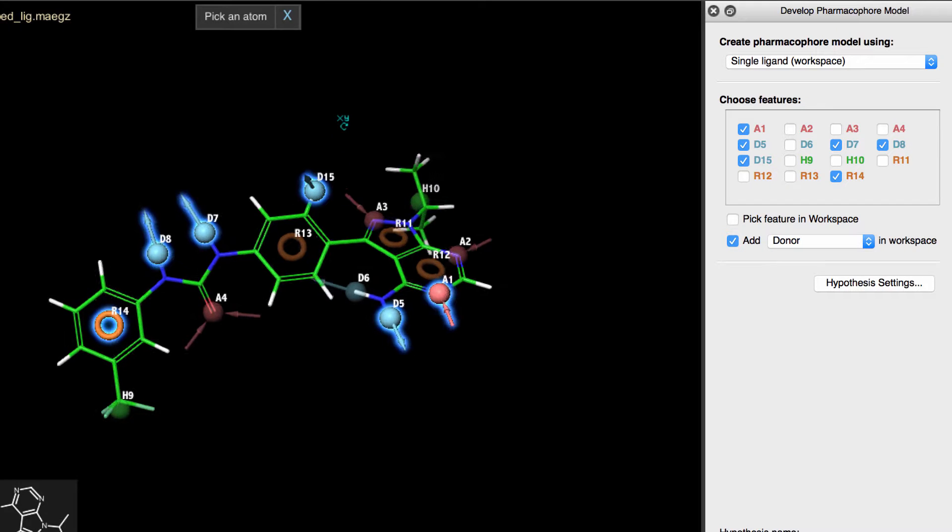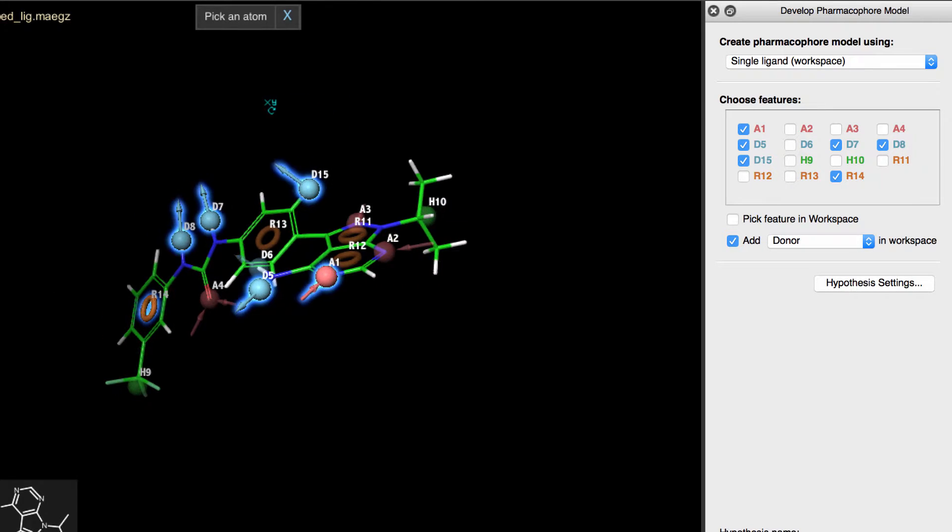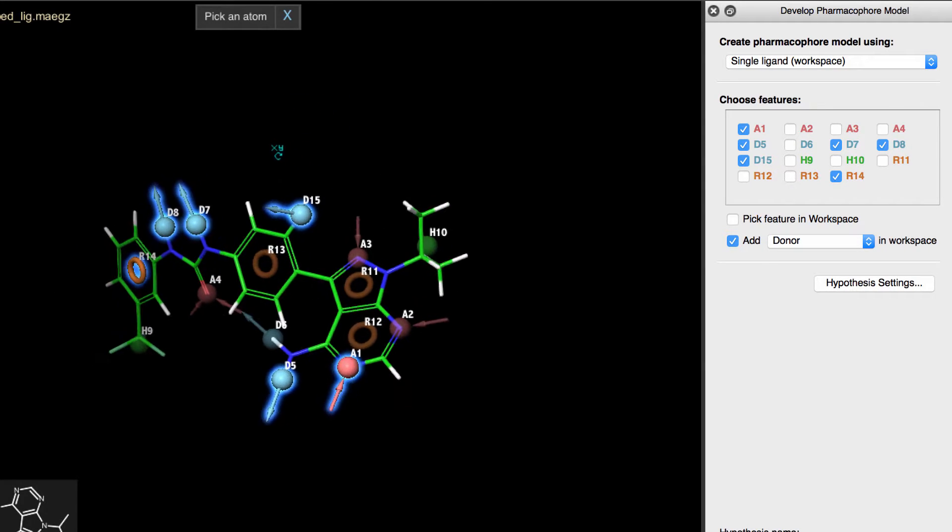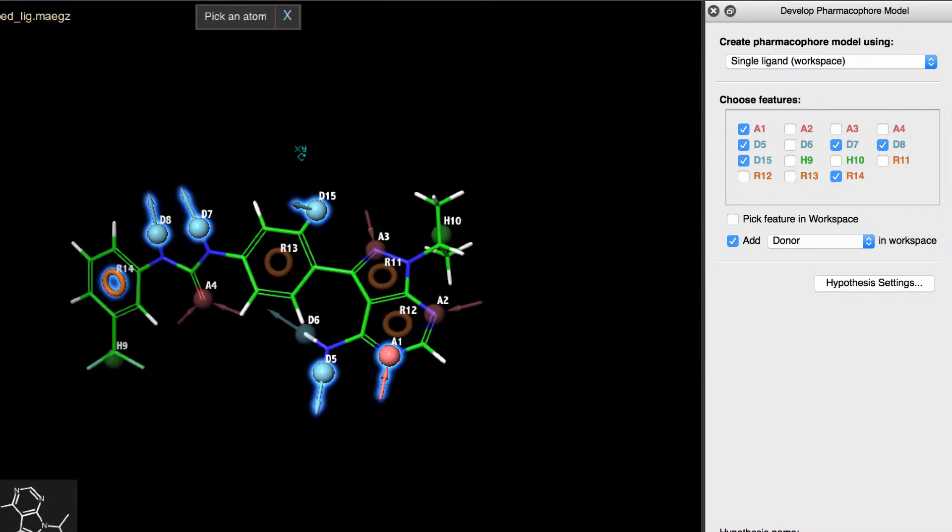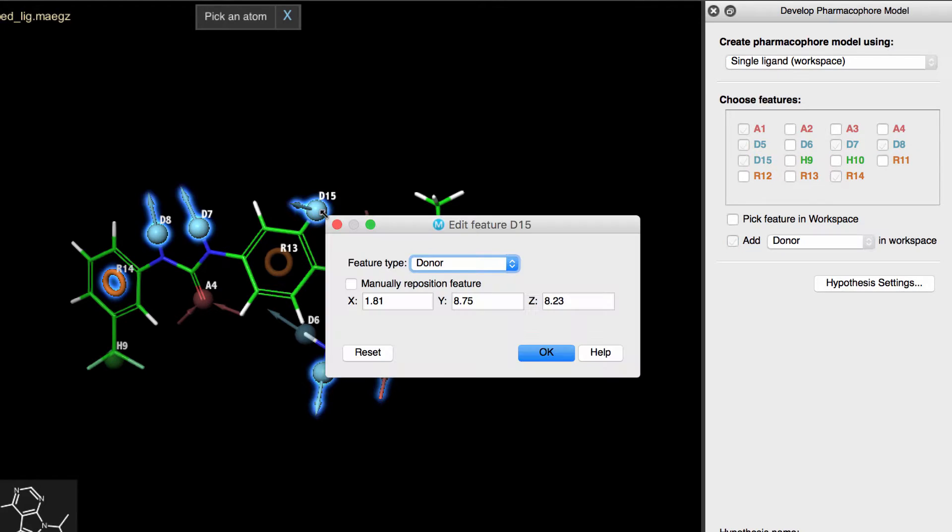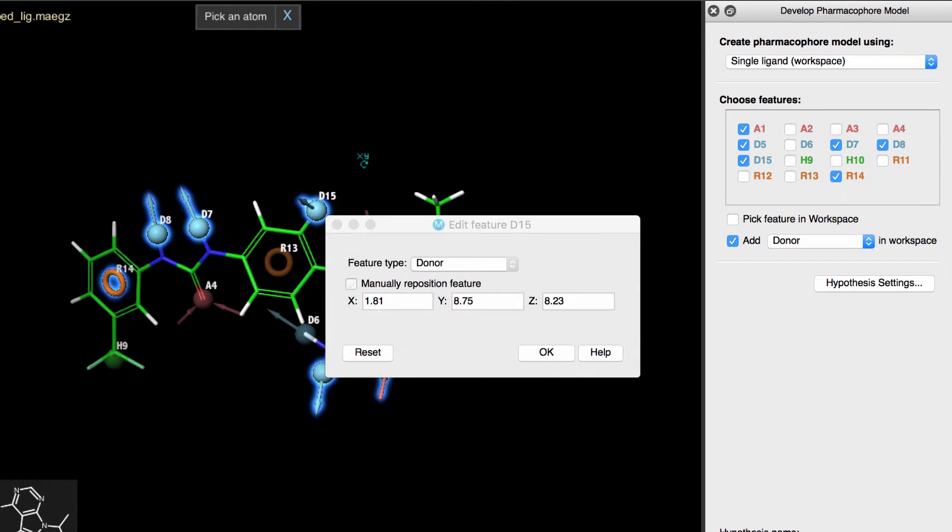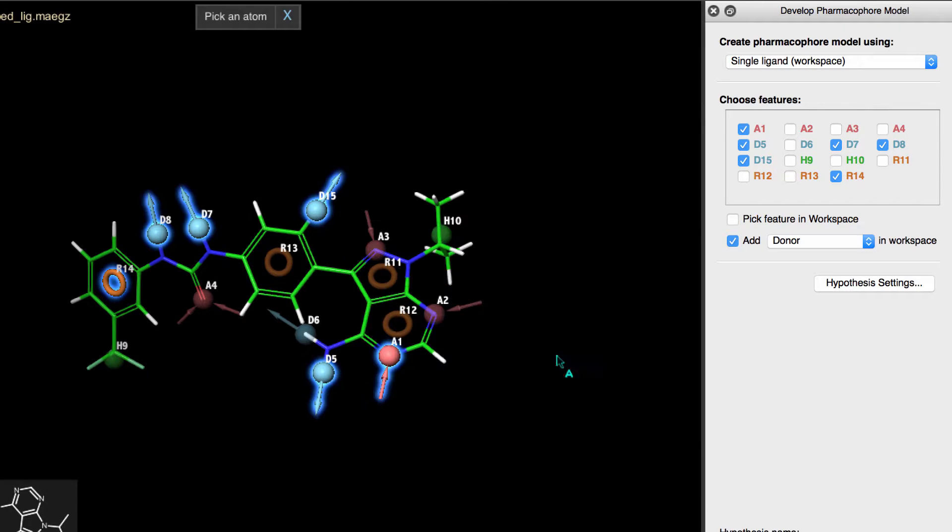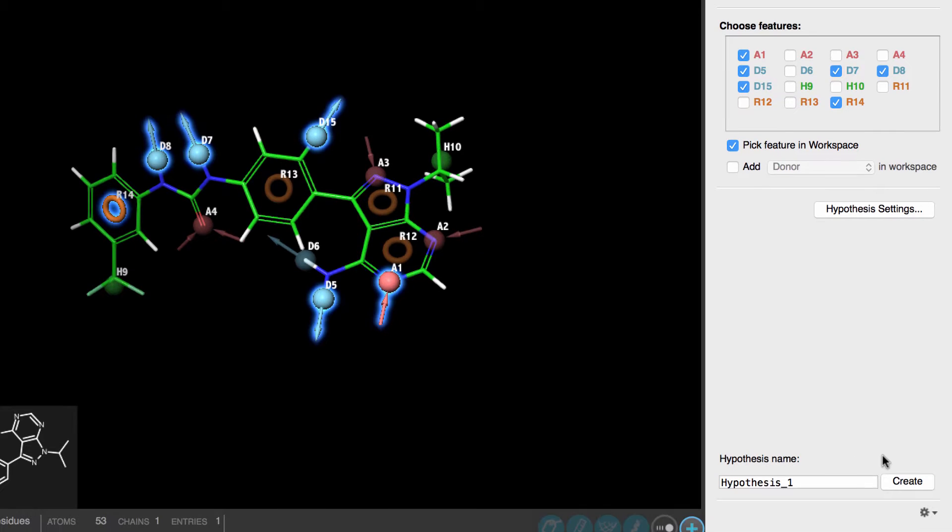And since this donor has a vector orientation, we'll need to adjust it. So, right-click on the donor, enable Manually Reposition Feature, then use the mouse to rotate or translate the feature so it's pointing in the desired location.